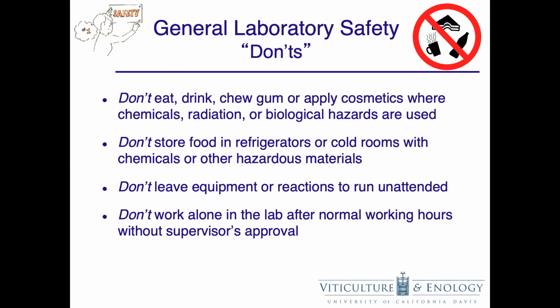If working alone is approved, make sure you are familiar with the emergency procedures and emergency contacts. A notification system within each lab when a person who is working alone arrives and leaves the building is advised. Each lab is responsible for having a working alone SOP.